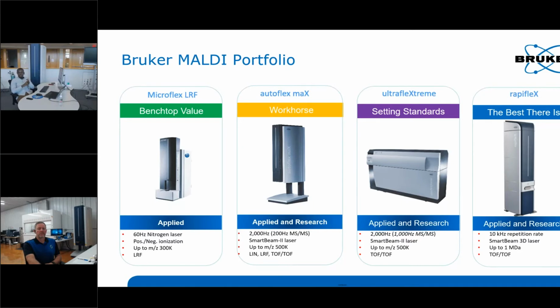MALDI imaging as well. And MSMS capabilities are very necessary for structural elucidation, as well as confident and specific compound identification. So MSMS experiments add a huge value to the instrument.